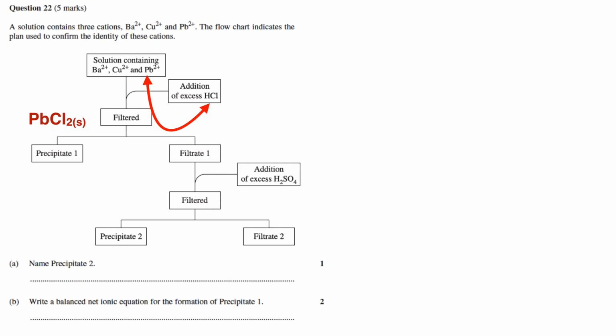It's now gone from solution. They've filtered the solution, and here's the remaining clear solution with 2 more hidden fish. But what did they do to this solution? They then added more bait.